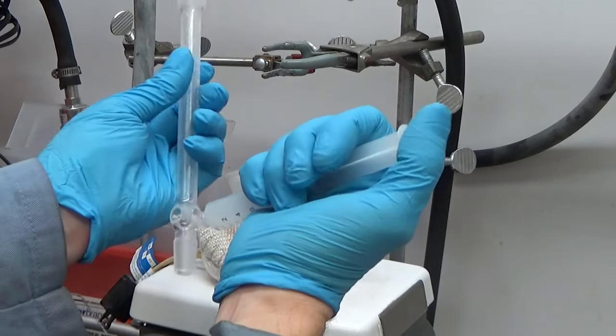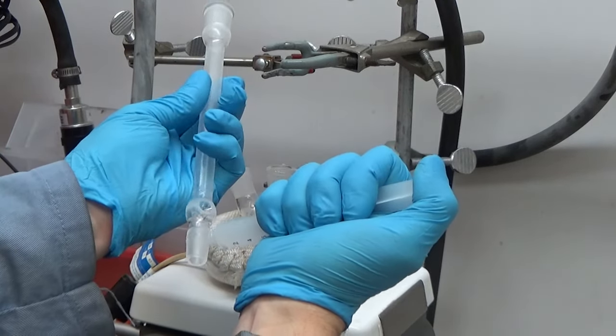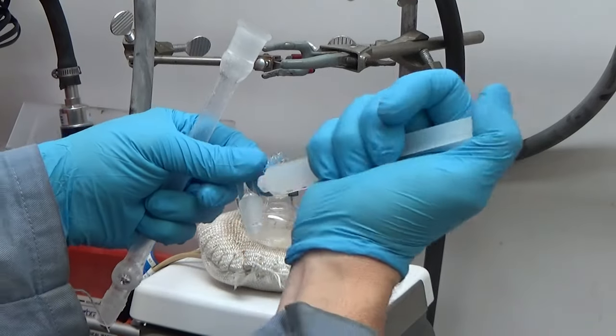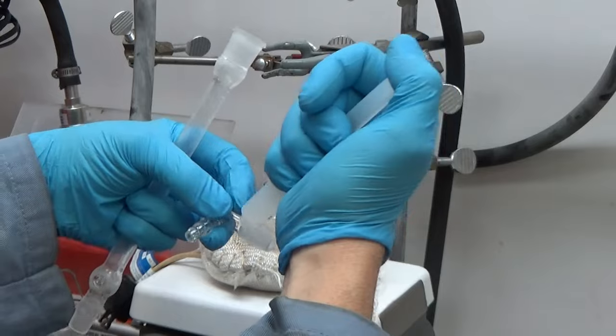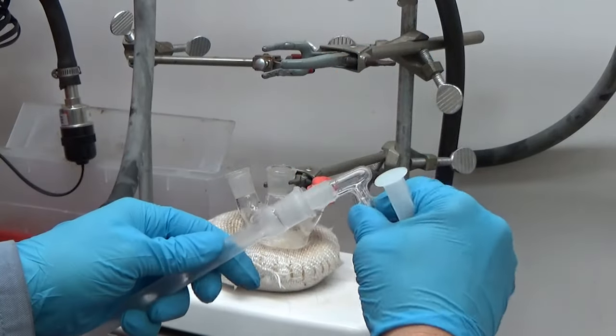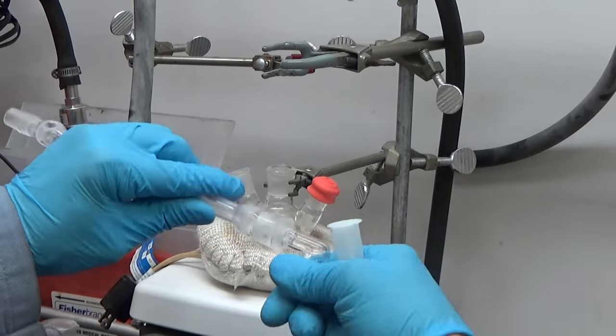So now we're going to add the condenser. I always add the grease just near the very top. And that way, when I put the condenser on, there's minimal chance the grease will get in the solvent. I don't think it really matters if it does or not. You can be a little bit more liberal with the hose adapter.